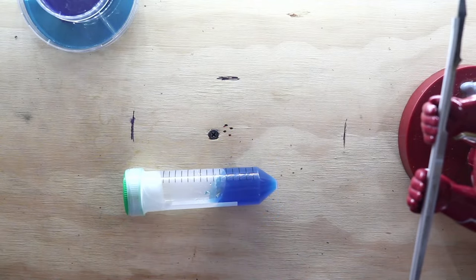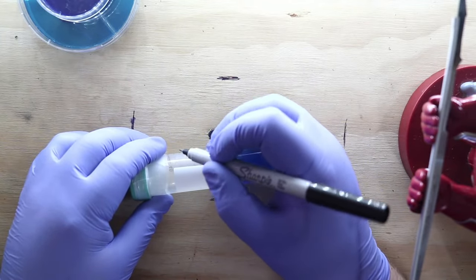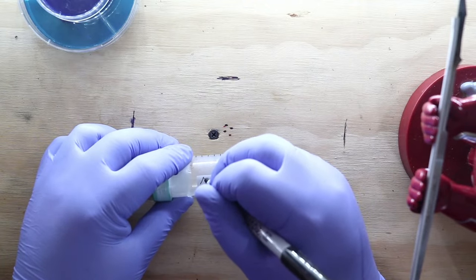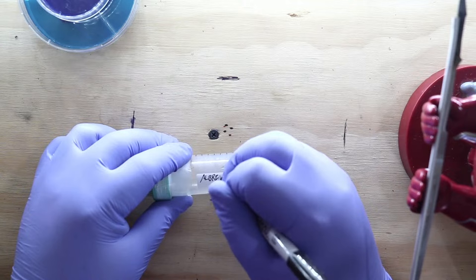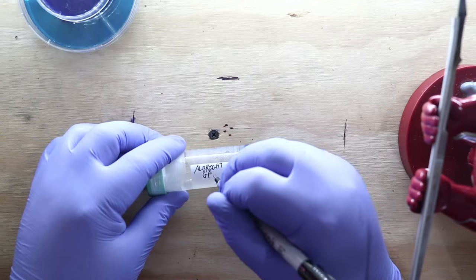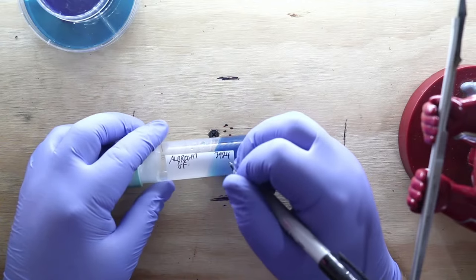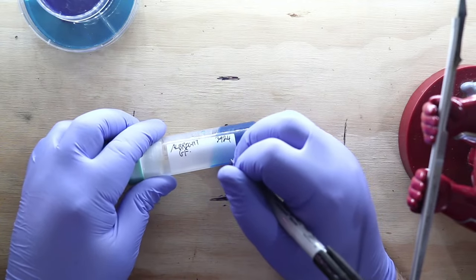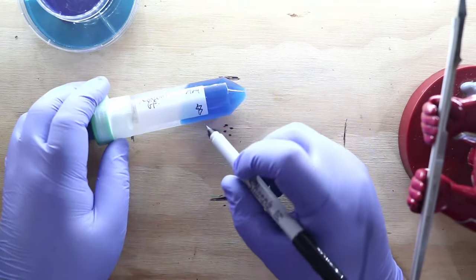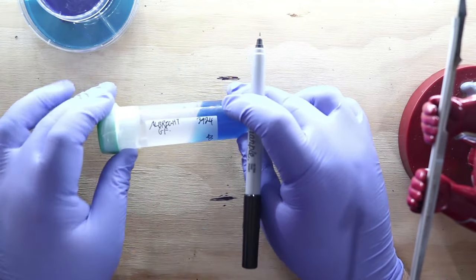All right, so what I didn't show on the dish a moment ago, I'm going to show right here on the slant. I'm right-handed, so... This is the Albright Grifola frondosa. Today is day 39 of year 24, so that's this batch number. My symbol is my symbol, so that way anyone that works in the lab knows who did this. And that's all I've got to put down for this right now.